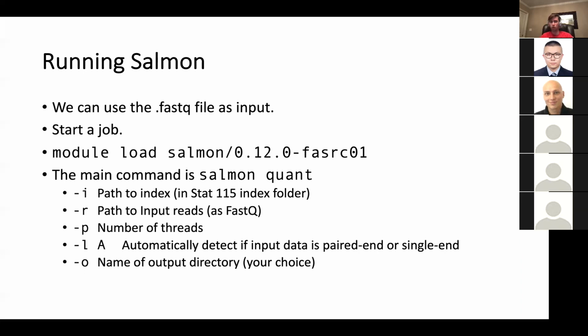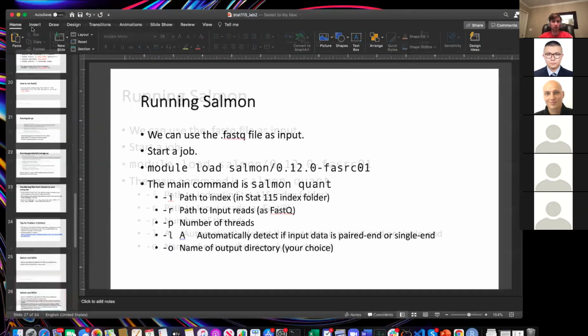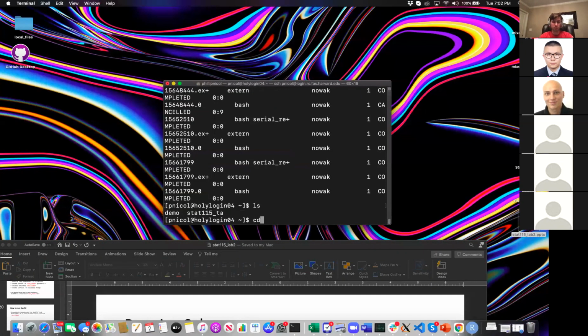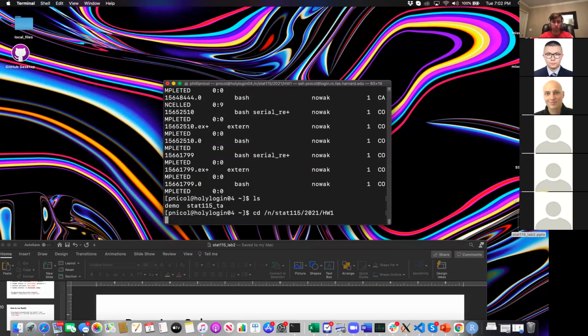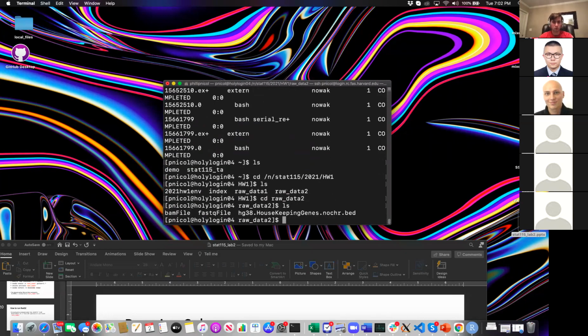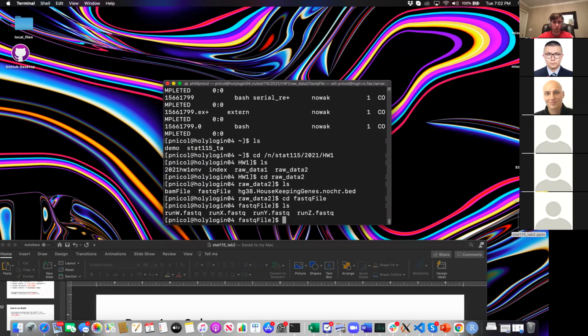Let me just check real quick. Yeah, they should be here. So we also have FASTQ files.